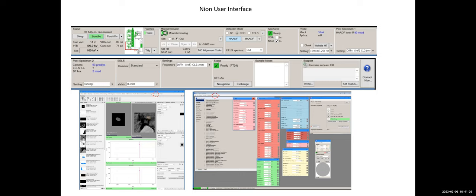And then you want to say, okay, what if those three values did not produce the effect I want, which means there is something that you need to compensate for, but only for such a combination of C1, C2, C3 values. So you can attach a control to this setting. And then they are grouped together. So when you change it, it will only affect this mode, which means the compensation value is saved in this mode. And when you switch to other modes, the compensation is different.